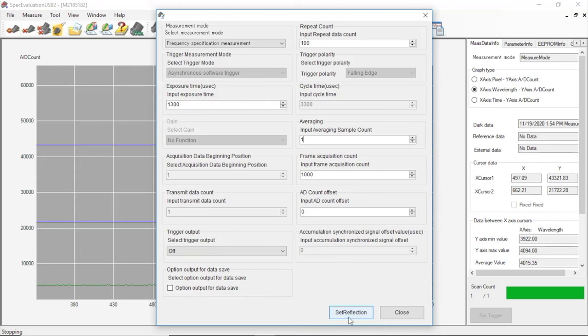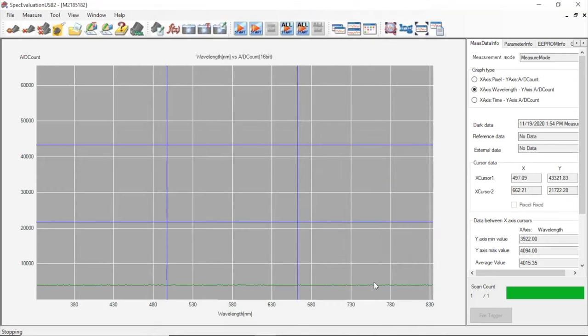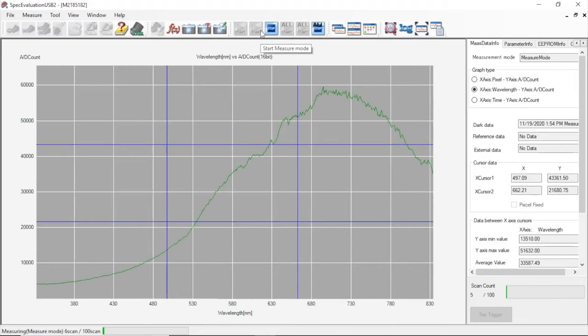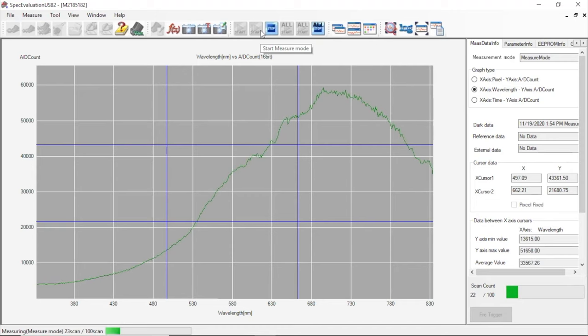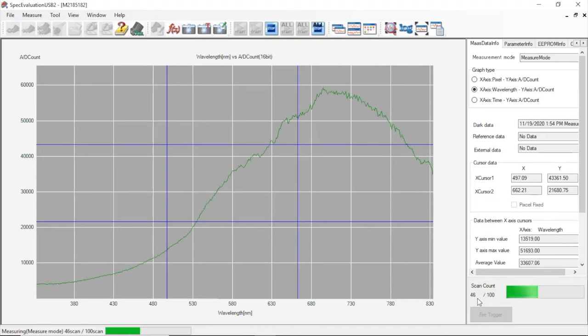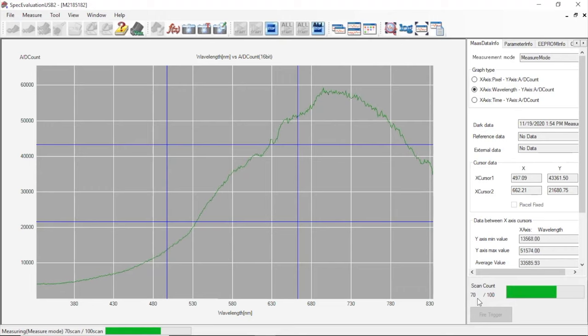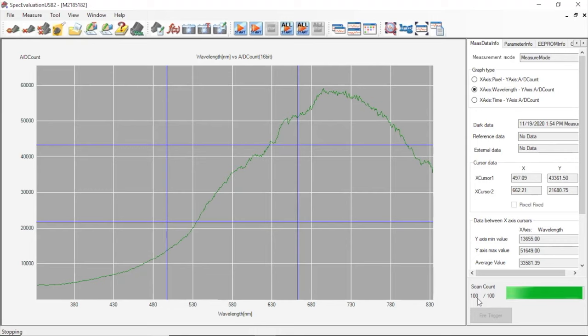Now to take this measurement, we'll reopen the shutter and then we'll click this button to take the light measurement. If we look at the gauges for this measurement, we'll see on the bottom right that each scan is taken until a total of 100 scans is collected. And now that the gauges are filled, the measurement is complete and we can move on to data analysis.